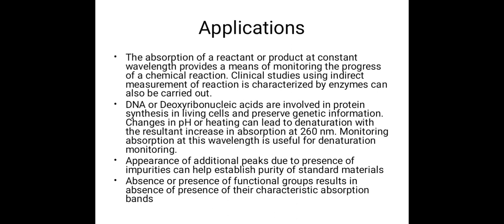DNA, or deoxyribonucleic acid, is involved in protein synthesis in living cells and preserves genetic information. We all know that. Changes in pH or heating can lead to denaturation with the resultant increase in absorption at 260 nanometers. Monitoring absorption at this wavelength is useful for denaturation monitoring.